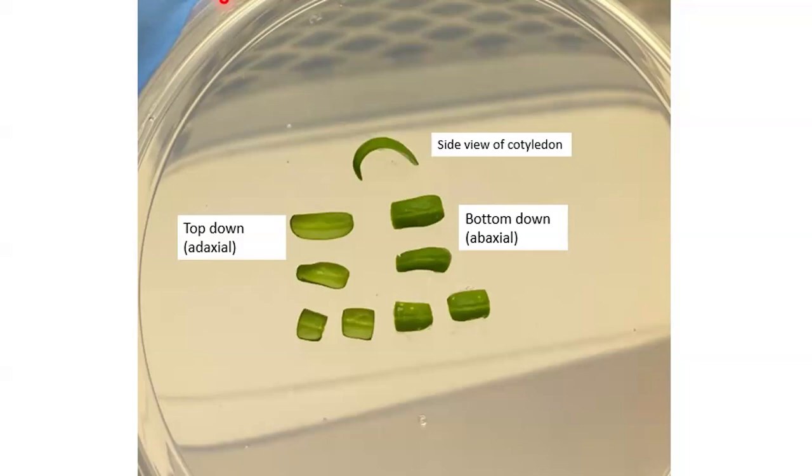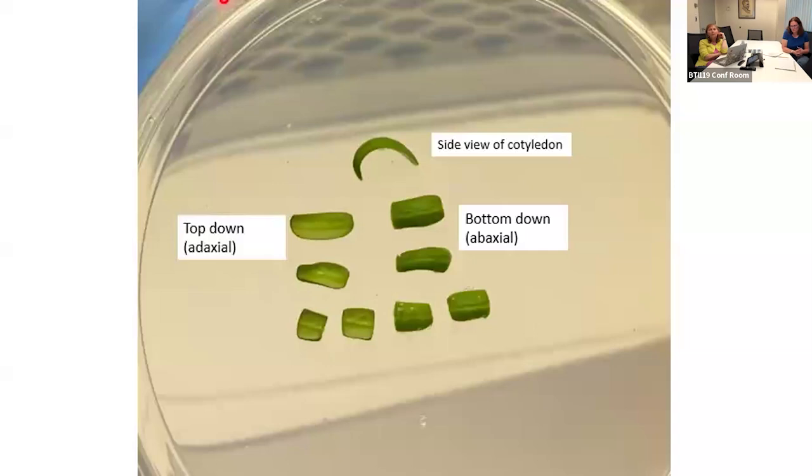What about Agrobacterium rhizogenes transformation in tomato? Yes, we did some a number of years ago, but we don't do it routinely. It was just one of our projects. Our collaborator wanted us to do some hairy roots of tomato, and it worked well. We got hairy roots from the tomatoes using the cotyledons.